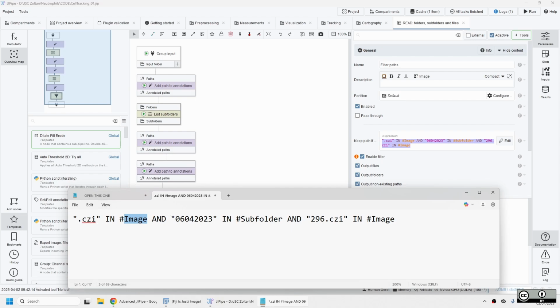And then I wanted to select a subfolder. This is, for example, a replicate or a patient who gave the neutrophil examples. And you want to test that. So now you limit your analysis to this particular subfolder. And we know what subfolders are because we made an annotation earlier. And finally, I limited this to one image because we don't want to sit here all day with that.